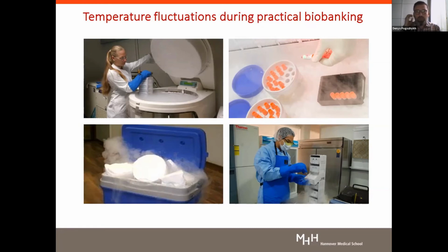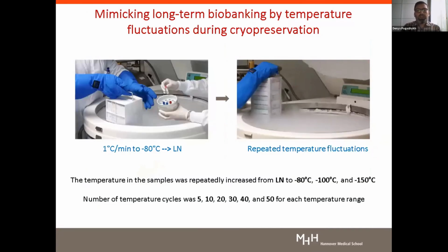And during long-term biobanking, for example with placental cells, which are derived from placenta at the birth of a person and can be used later, in many years if not decades, such temperature fluctuations in the sub-zero range can really accumulate with time. I'm not, of course, talking about interruption of the cold chain, but small fluctuations in the sub-zero range. In many years, somebody opened the fridge, took the sample, moved the sample, just stock management. This can happen.